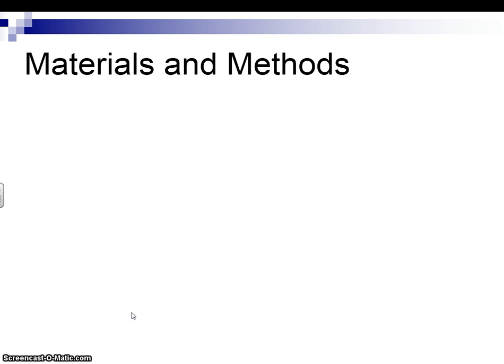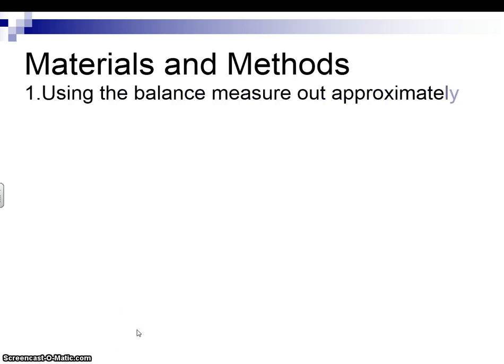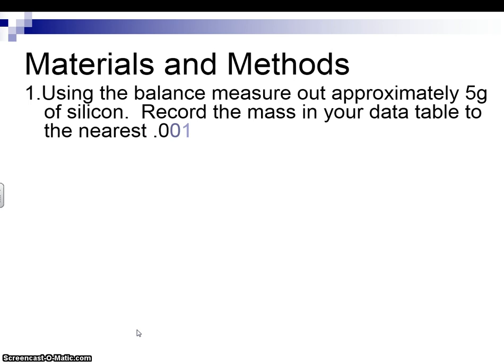So I'm going to go through the example as if you're starting with silicon, but you probably want to go ahead and start with something else. Some of you can start with silicon and some of you start with something else. That way everybody's not standing around wasting a bunch of time. All right, whichever one you decide to start with, the first step is to go ahead and get your samples.